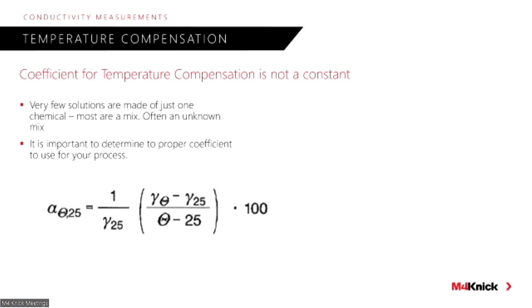So the lab value, because obviously if we're making a conductivity measurement online, talking raw conductivity, it's say 200 degrees Fahrenheit. We take that grab sample, we bring it to our lab, it's cooled down to say 77 degrees Fahrenheit, the conductivity has changed. And what we utilize in the Knick technology is what's referred to as solution temperature compensation. And we have a number of different capabilities of inputting that coefficient, if you will, into the electronics.